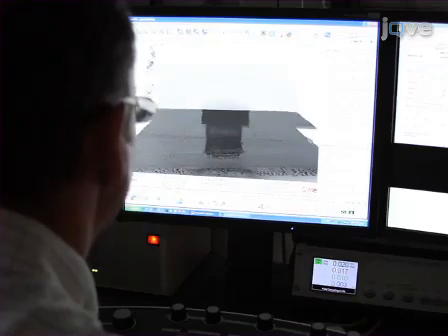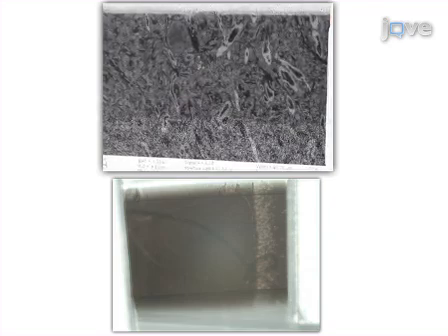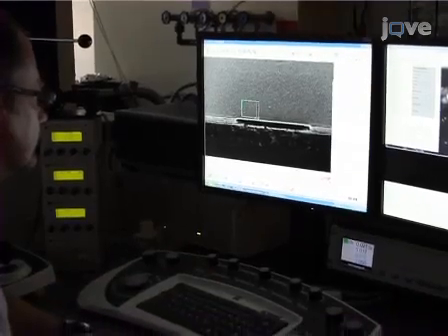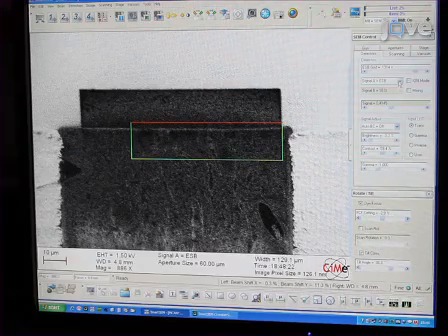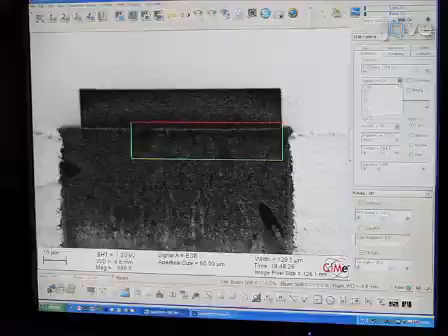Next, switch to backscattered imaging mode to view the milled face that overlies the region of interest. Using the light microscopy reference image taken earlier and the image of the milled face, locate the exact region on the block to be milled and imaged. Using the gas injection system of the microscope, deposit a protective layer around 1 micron thick of carbon or metal onto the surface of the block above the region of interest.